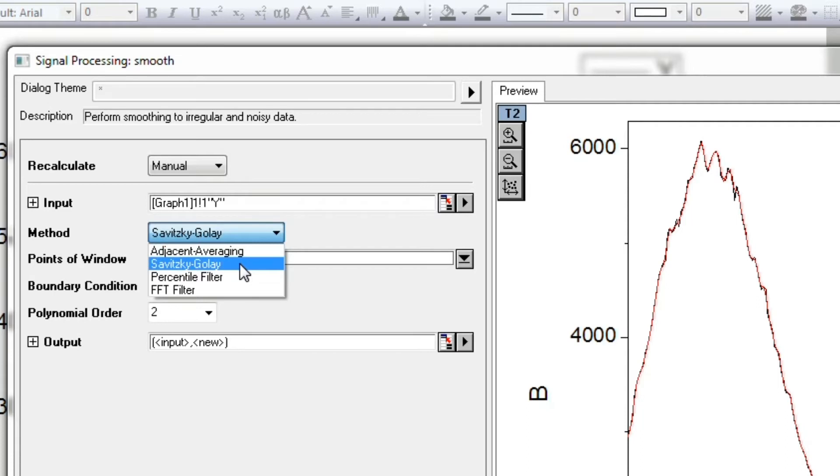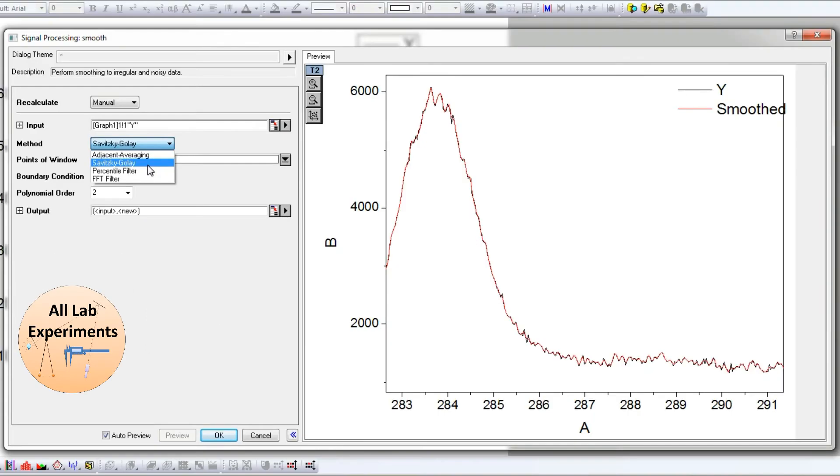Basically we have Adjacent Averaging and Savitzky-Golay, two options to smooth our data. People usually frequently switch between these two methods, but it is necessary to know which one is OK for which data and up to what extent we can smooth.